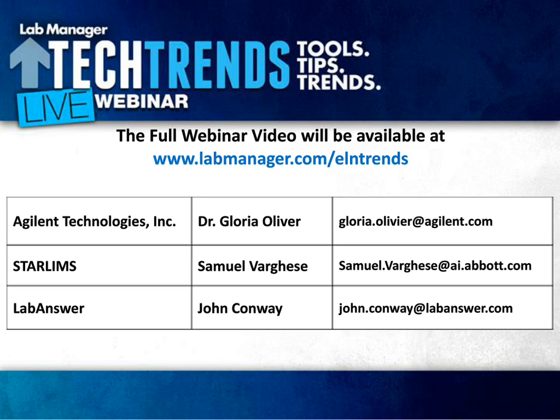Great, thank you. How has the FDA responded to the use of ELNs in general, and what are the specific challenges of validating the use of ELNs? Gloria, maybe I can start you off with that.